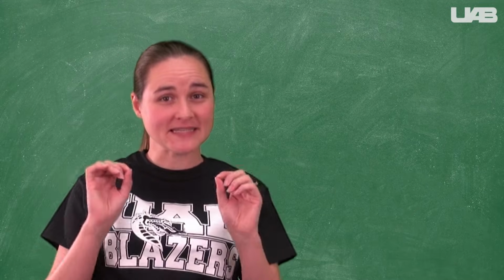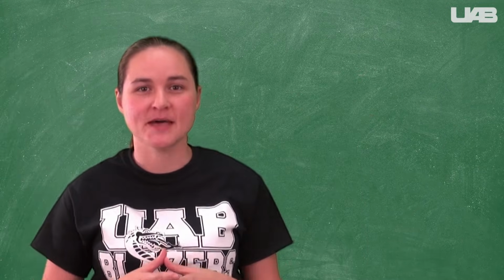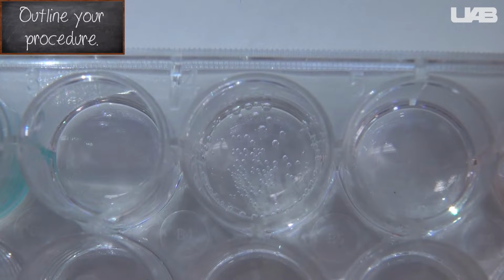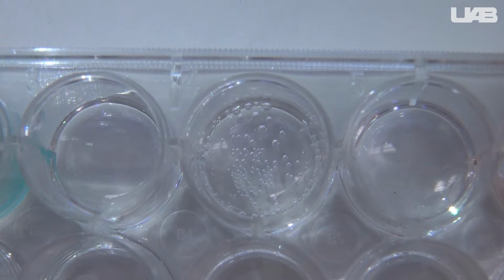We don't expect big, exciting bubbles in our samples in this lab. Rather, you should mix the two solutions and wait a few minutes to see if small bubbles form on the bottom of the well plate.